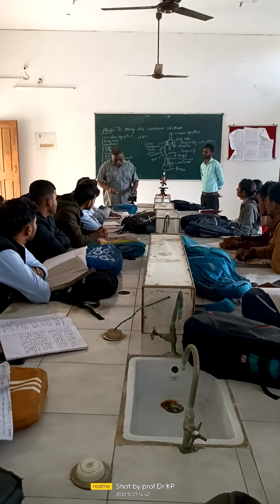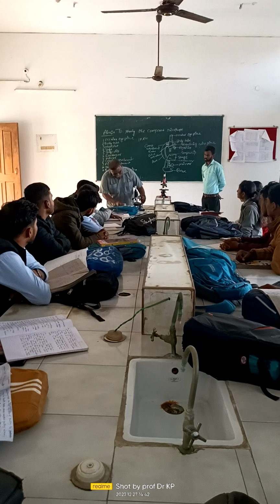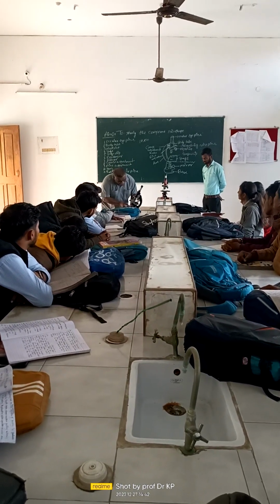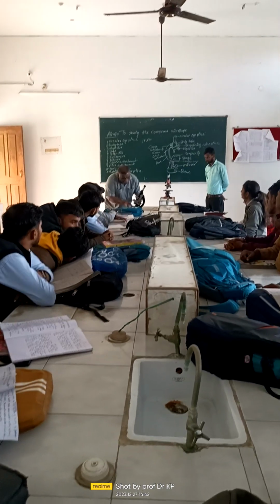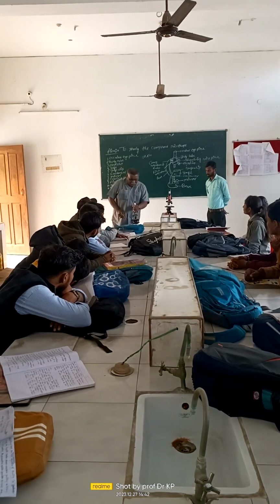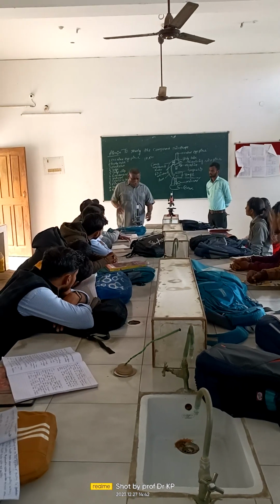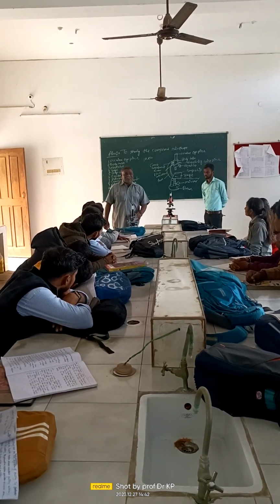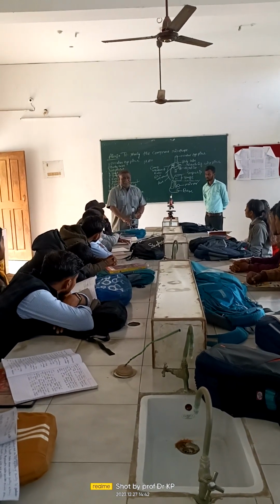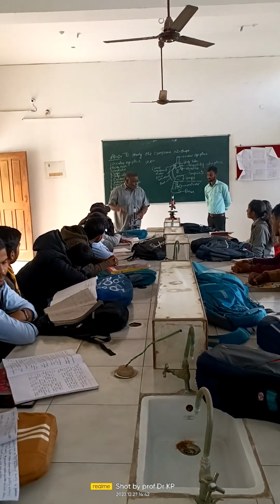Clear now? So, how to use a microscope: as soon as it is given, within 2 minutes, or within 1 minute, you should know how to focus it. Unnecessarily, like a blind man, you should not be moving the screws here and there, approximately up and down; this kind of thing should not be done. Okay? One hand you must use for screw adjustment. One hand you must use for holding the object. If you are right-handed, the right hand is better for holding the slide. Okay? So, you want to focus your material.